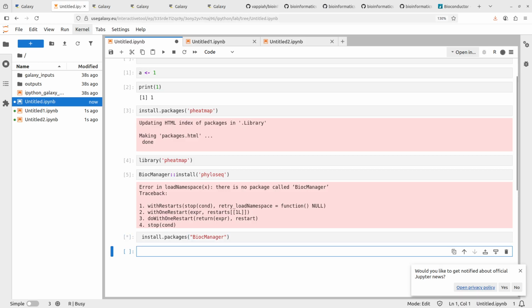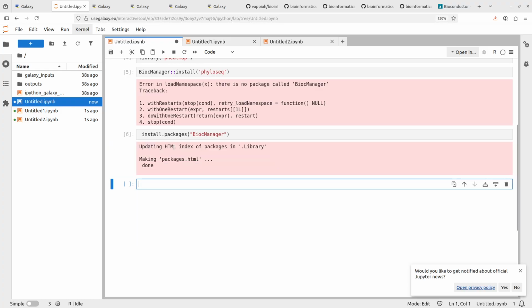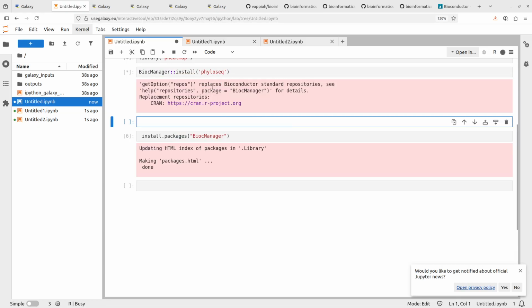And then I'll run it. Then you'll see the star here, meaning that it's working, it's busy. So once it is done, then I can just come back and run this to install. Right, so to now do all those things for you.